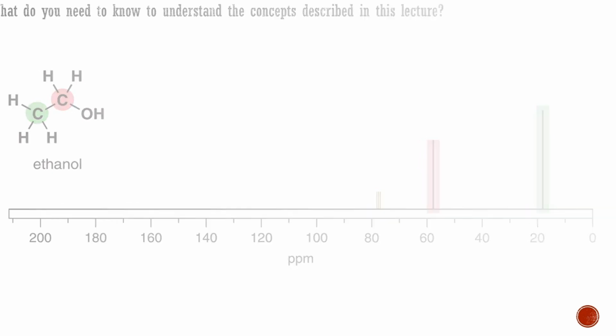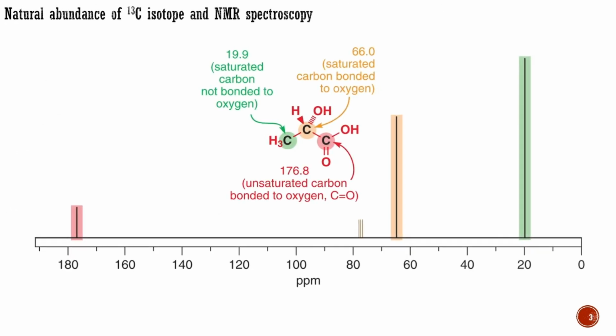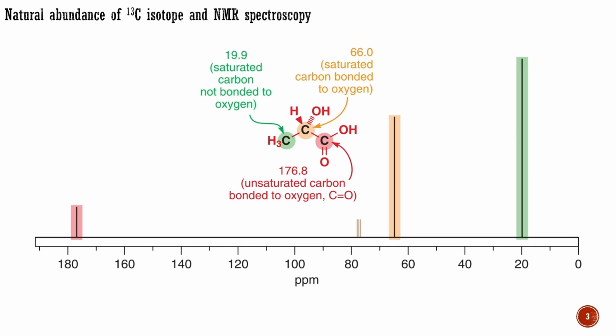The last spectrum I described in the previous lecture was the carbon NMR of lactic acid, also known as 2-hydroxypropanoic acid. Every time you move your fingers, you produce some lactic acid from glucose in the muscles of your arm. It is the breakdown product of glucose when you engage in anaerobic exercise. Each of lactic acid's carbon atoms gives a peak in a different region of the spectrum.